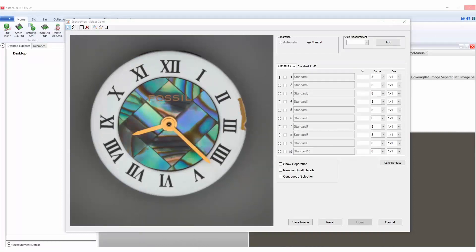To start the regional selection process, select the Create Regions button at the top of the screen. Once selected, you will see the cursor change to a plus sign. Select the first regional area in the multicolor center by defining a box within the green color. Select the next region in the multicolor center in the area of blue by defining the box. The final region should be selected to include the watch face with clearly defined colors. Once the regional areas are defined, the user will then select colors within the region, either as a defined box size or rubber band selection. For the multicolor regional selection, the select all function allows the user to select the entire defined box, and will be used for both the green and blue colors.